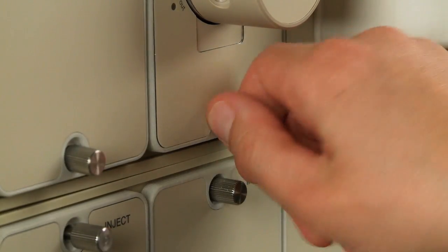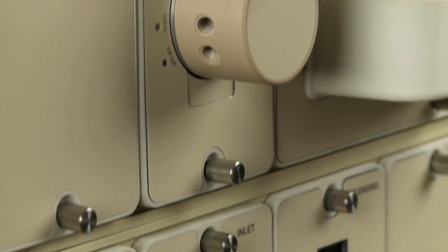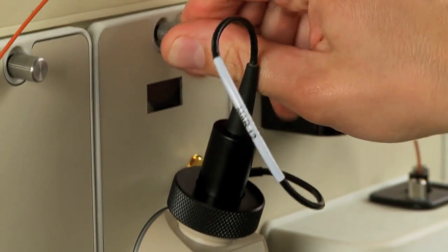Secure the module in its bay by tightening the two captive screws. Do not over-tighten these screws.